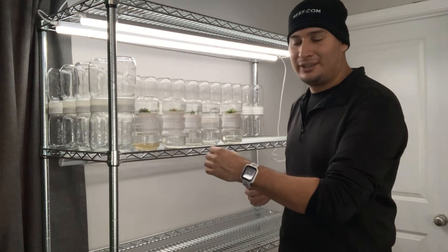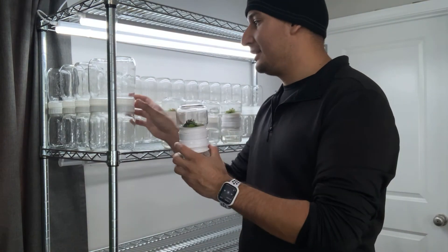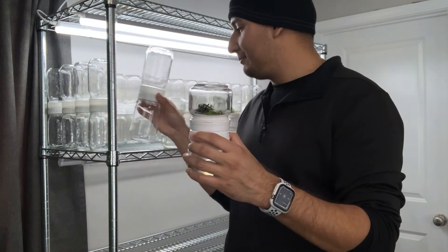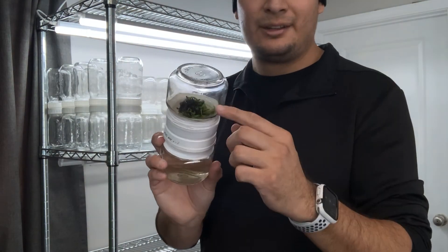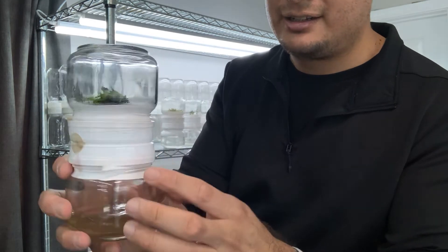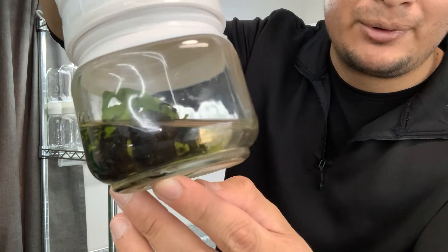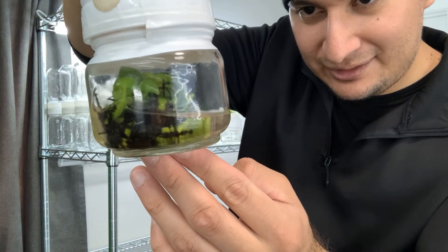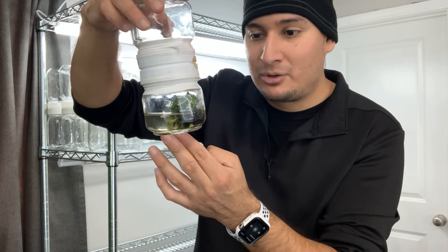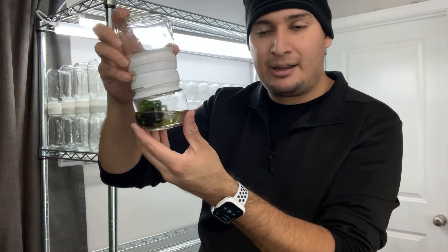The first thing I want to do is retire this small flask and upgrade to the bigger one — this is 8 ounces and that one is 16 ounces. Here's a little update: this is a Nepenthes Tungata, and all the black you see there is roots. This Nepenthes has produced so many roots — I must have done something right with the media. I still have a good amount of multiplication happening.